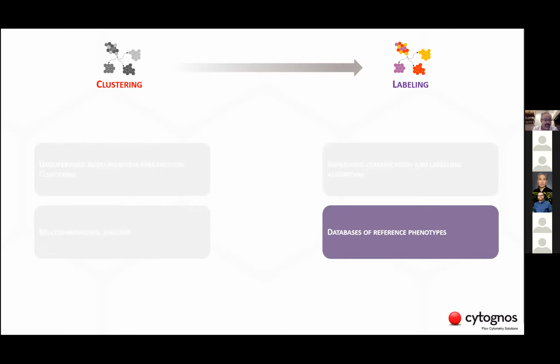For example, human peripheral blood under normal conditions, human peripheral blood from patients with a given disease, or it can be a sample from lymph nodes or peripheral blood from whatever. And those samples are somehow representative of that type of sample in terms of phenotypes and the frequencies of those phenotypes.